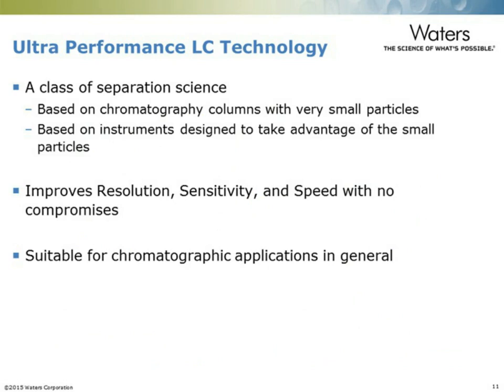The separation that we chose to do is based on ultra-performance LC. UPLC is a class of separation science which is based upon using very small particles of packing material on instruments that are optimized to minimize dispersion so that you take advantage of those small particles. The consequence of ultra-performance LC is that you get improved resolution and sensitivity because of the reduced dispersion, and usually an improvement in throughput. It works for all kinds of chromatographic applications, but it certainly is very suitable for the reverse phase techniques that we wish to use here.